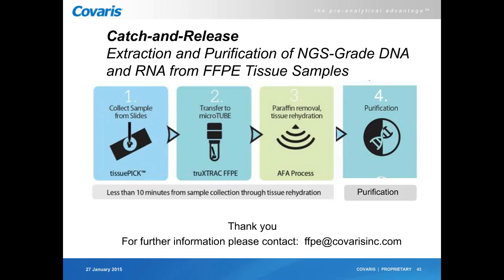Okay. Are tissues that have been put on slides and covered by paraffin for a long period suitable for your technology? In theory, yes, meaning that we already developed the tissuePICK to collect the tissue from the slide. But again, what do you mean by long period? And also, what was the storage condition? That's a key parameter. Some studies have shown that storing in a fridge is much better for RNA than room temperature.